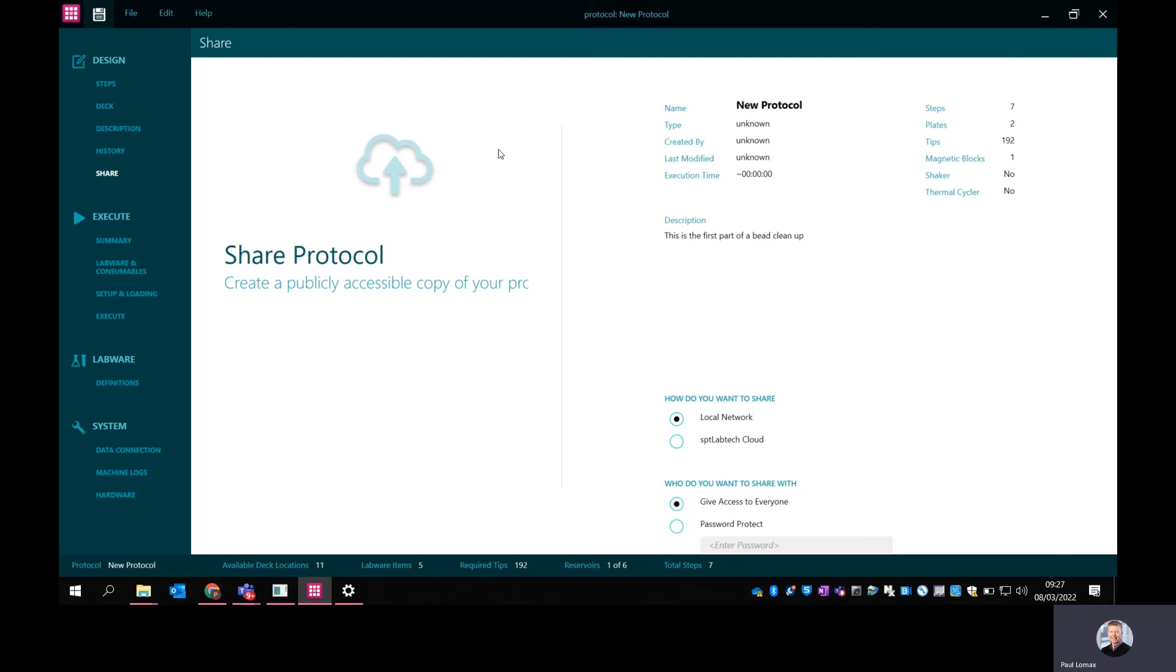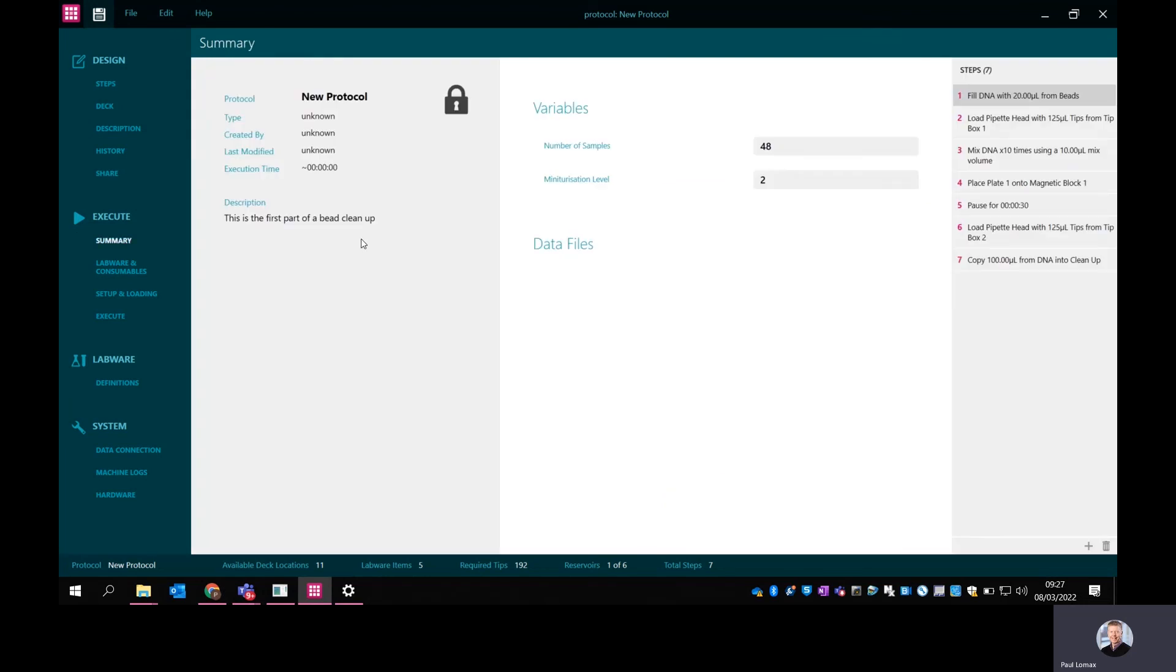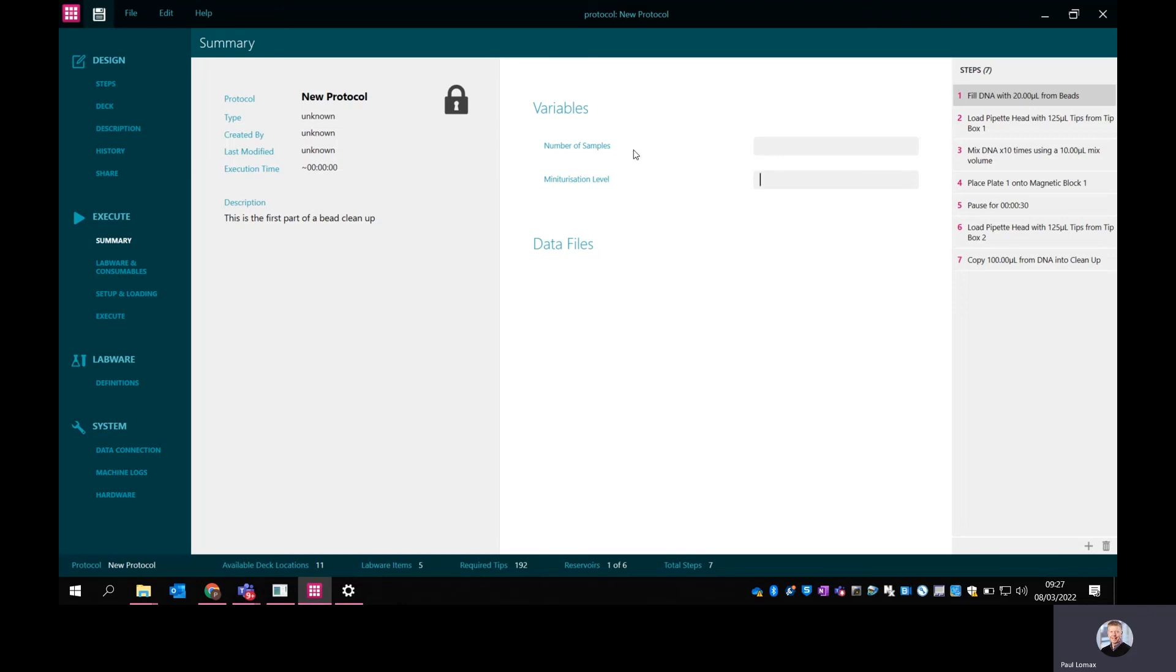If we went on to run that protocol, we'd go into the execute portion. There's a summary of the protocol, which is essentially the first part of the bead cleanup. There's the description that I just put in. And there's also if you had variables - this is just an example that I've put in at the moment just to show this because I didn't select any variables. I've just set this up to give an indication what it looks like, where you could have things like number of samples, miniaturization level, and if you wanted to bring data files in. This purely depends on the protocol that you've set up.